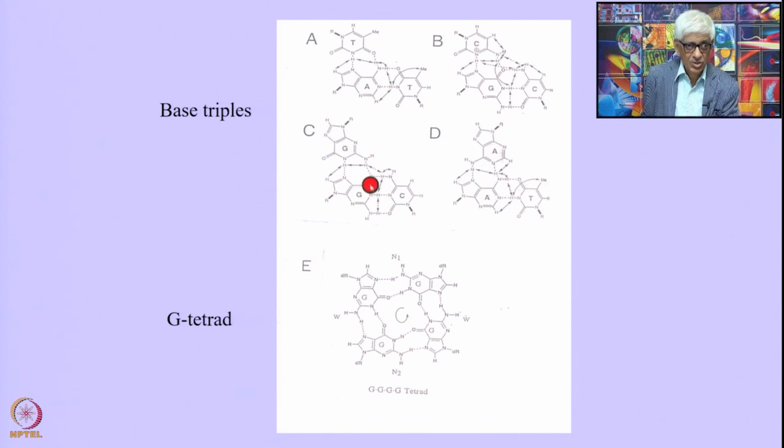And now what are these arrows here? These arrows indicate the short distances, because these are the observables in NMR spectra. What are indicated are the proton distances. All these proton distances are short distances, and we use these short distances to identify or assign the individual bases and the individual protons. That is why these are indicated by double headed arrows, that we can actually observe these by recording spectra in water.